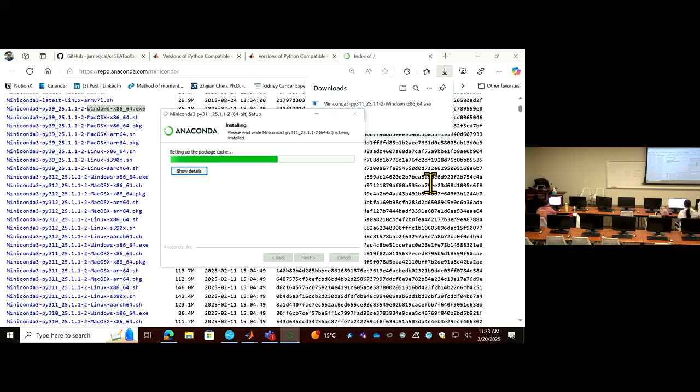If you don't have that, follow the link here, it's number C. I just found which version you want. Got it? Okay. It may take some time.